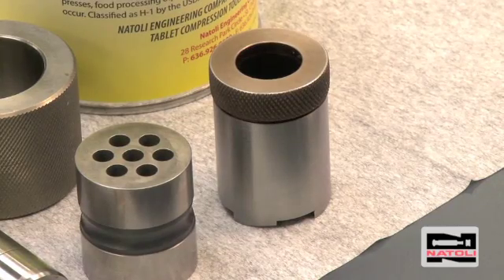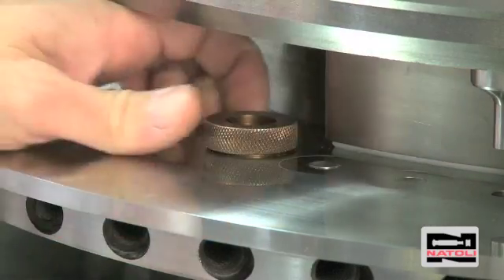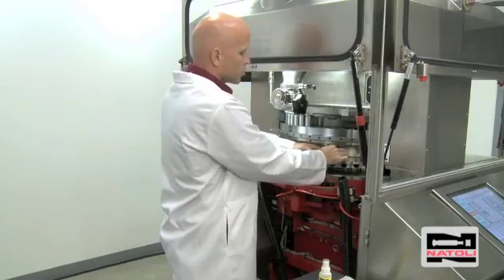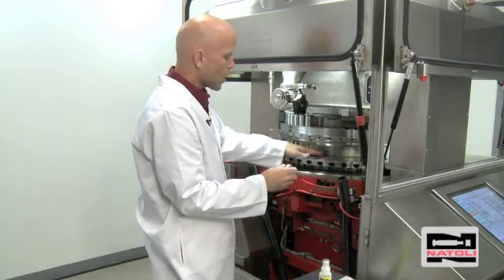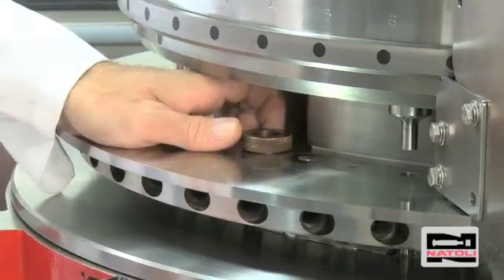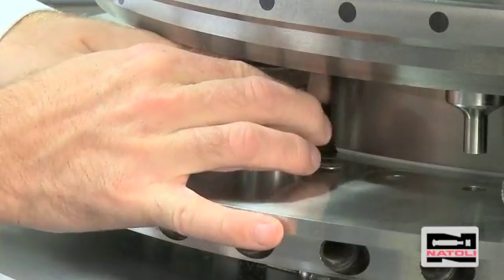After we clean the punch guides, we take a die seat cleaner, insert it into the die pocket, and rotate it around to remove any debris out of the bottom of the die pocket. This allows your die to sit flush in the pocket, flush with the turret. Next, take the die seat cleaner and rotate it clockwise while applying constant downward pressure to thoroughly clean the die pocket.